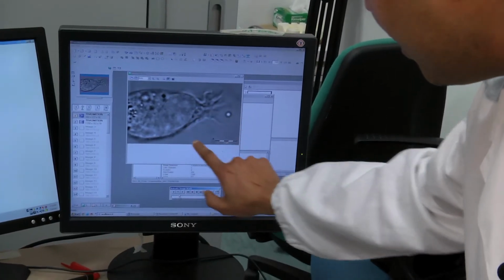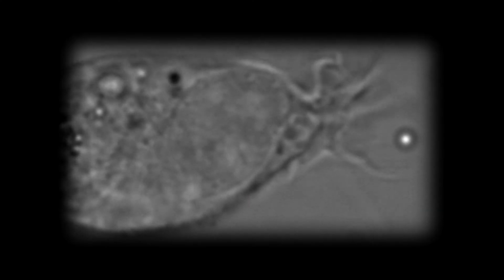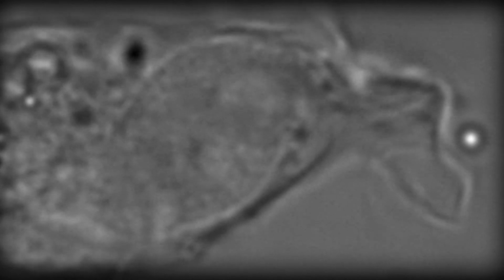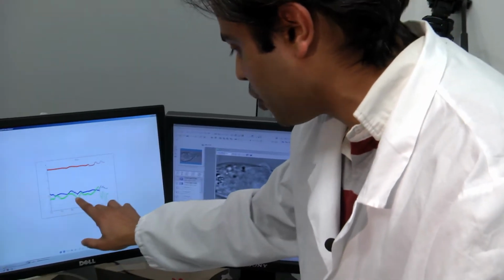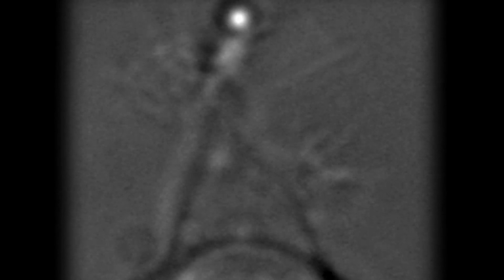A neuron is there, and in front of this is called a growth cone, in which you have the lamellipodia. The lamellipodia is now hitting the bead. With the help of these traces, one can find out what is the displacement of this particle from, let's say, from here to here. During these experiments, we have seen that this lamellipodia, they protrude and retract.